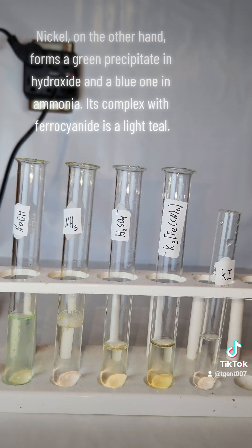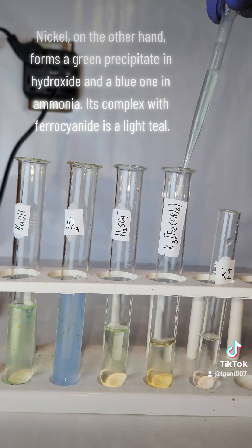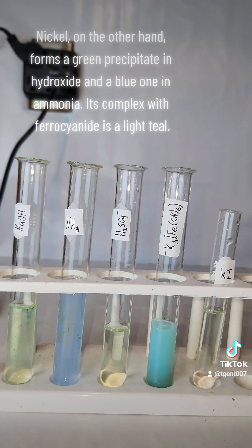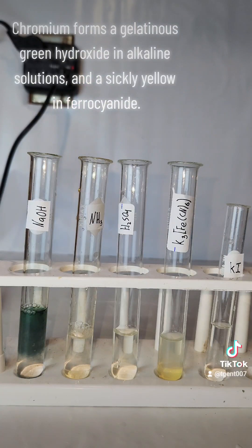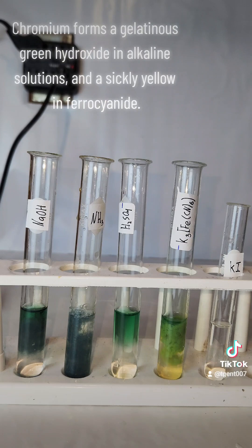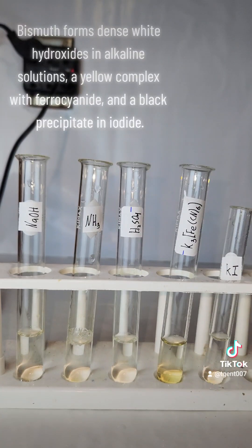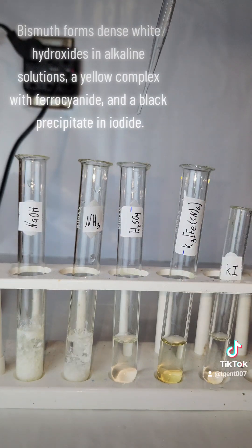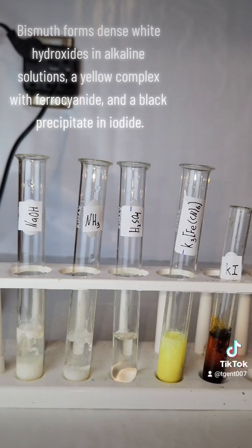Nickel, on the other hand, forms a green precipitate in hydroxide and a blue one in ammonia. Its complex with ferrocyanide is a light teal. Chromium forms a gelatinous green hydroxide in alkaline solutions and a sickly yellow in ferrocyanide. Bismuth forms dense white hydroxides in alkaline solutions, a yellow complex with ferrocyanide, and a black precipitate in iodide.